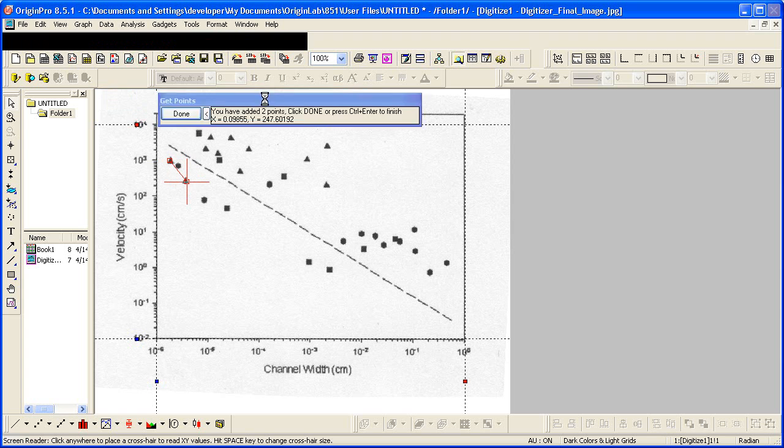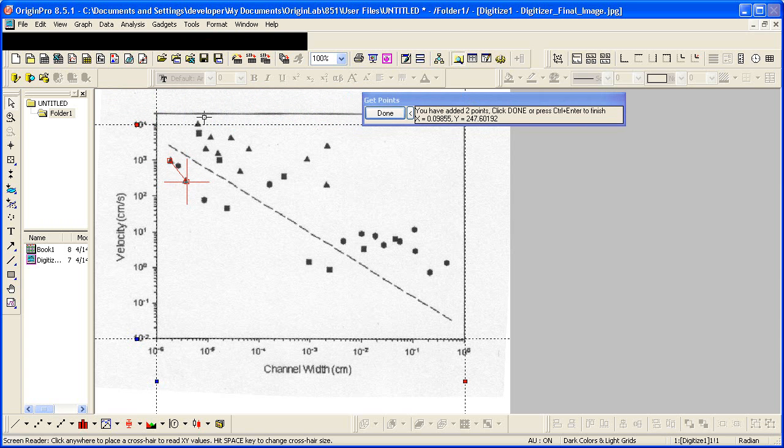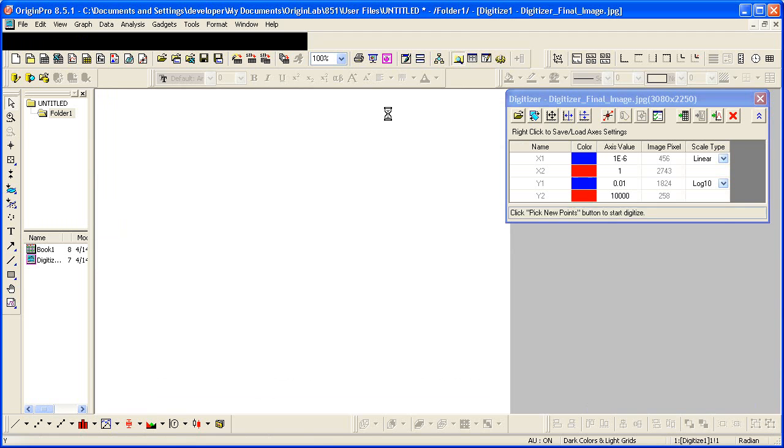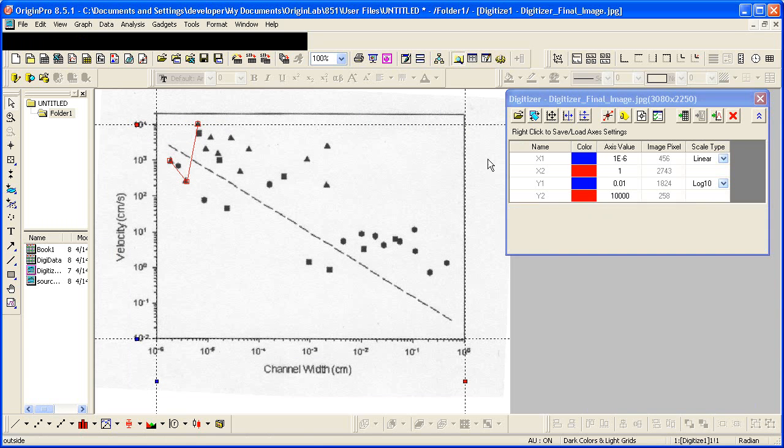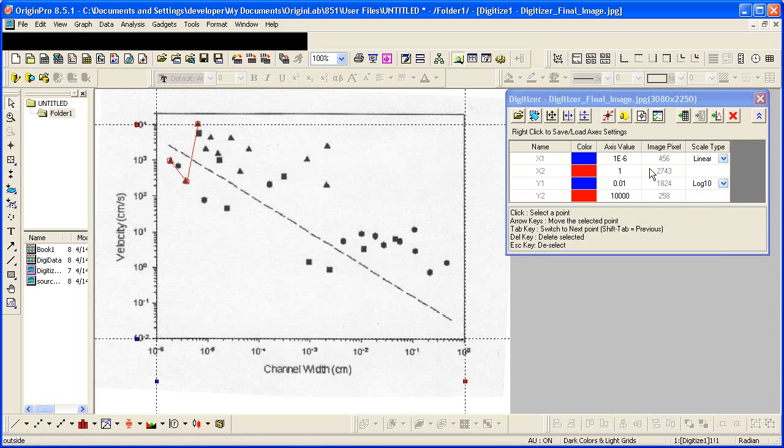This can be dragged out of the way here. I'll just select a few points. I'll hit done. We're brought back to the dialog with the controls here.